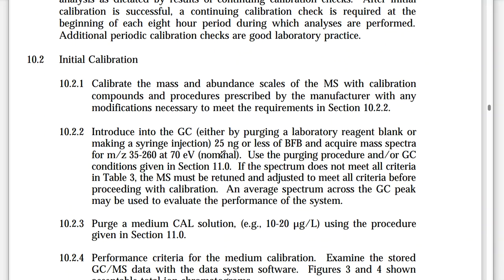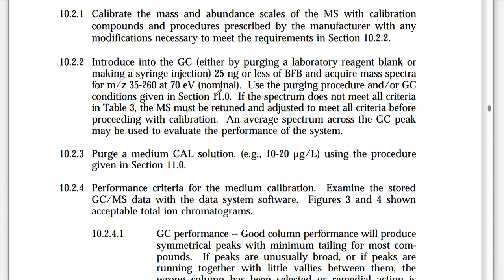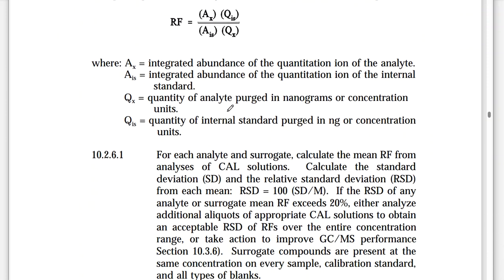Calibration also includes any type of internal calibration that the instrumentation has to make on itself. So not only just my cal solutions, but also let's make sure that the instrument is reporting 0 when I zero it out. Let's make sure that the instrument is giving us an absorbance or a signal of 0 when nothing is going through it. Those specifics, though, are not going to be detailed too much in here, because that's really dependent on your equipment and your instrumentation. But you're going to find at least a mention of calibration of the machines in this section if the method has an instrument that it's using. All right, so as I scroll through, that's what you're going to be seeing.